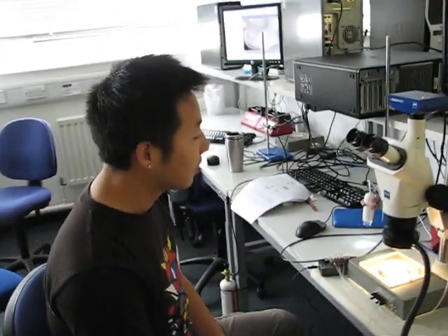Hello, Zhu. Can you tell us something about the experiment? Yes, sure. Hi. We are trying to conduct a very beautiful microfluidic experiment.